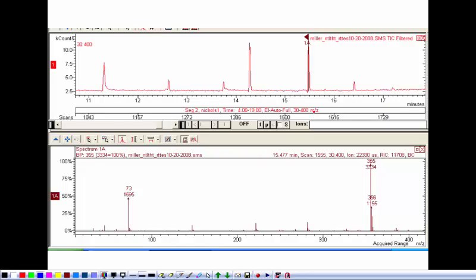And that becomes important because let's say that you wanted to analyze a sample, and this is, I think, one of Dr. Miller's beer samples. She studies oxidation, and so she wanted to see if you could see the oxidation of a beer sample by heating it up to 60 degrees overnight and seeing whether the oxidation products could be seen in the vapor phase above that.